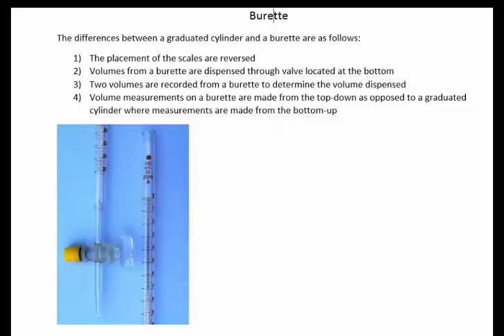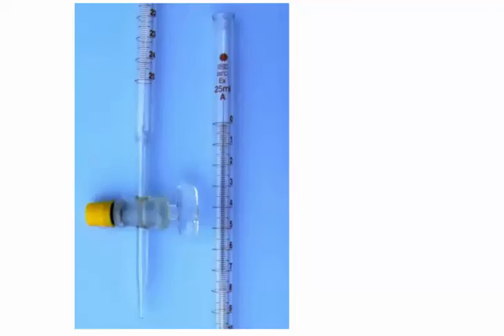And finally, I'll show you examples with a burette. The differences between a graduated cylinder and a burette are as follows: the placement of the scales are reversed.